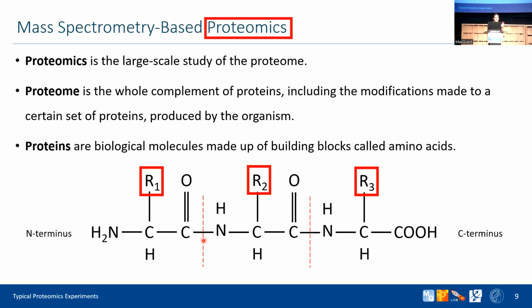You have your sample, whatever is in there that is made of amino acids, and that's what we're going to try to identify and quantify. So don't be confused about this abstract definition of proteome during the week. I hope that we know about proteomics now.